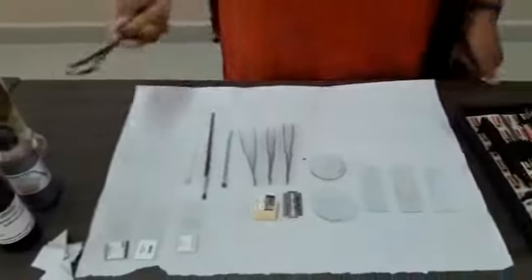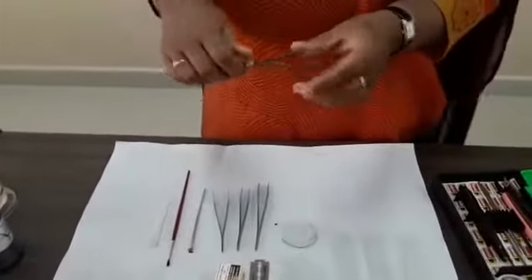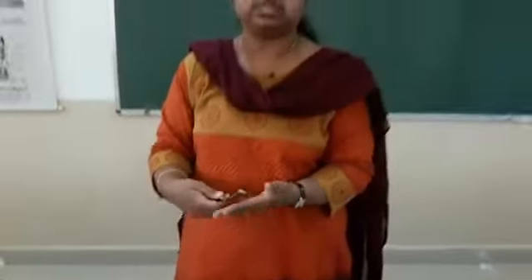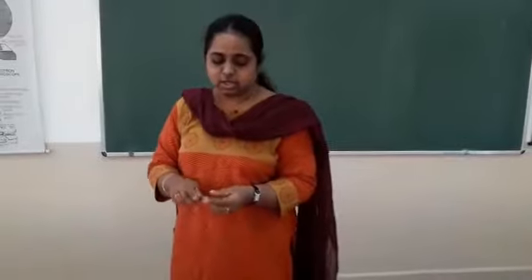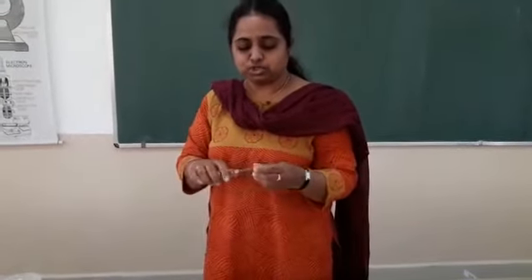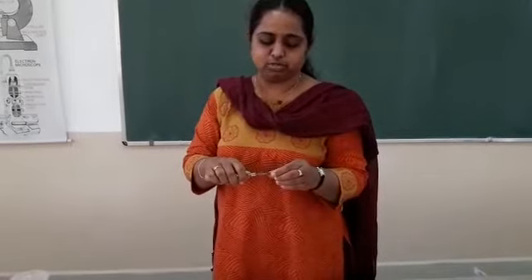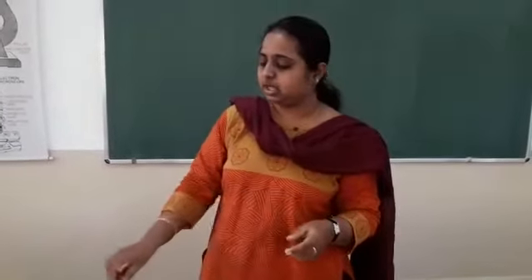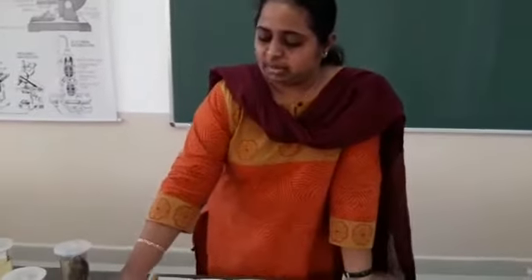Now, this is the holder. When you do physiology tests — like tests to detect the presence of carbohydrates, proteins, or fats — you need to make use of this holder. This holder is also useful in the chemistry lab; you will be using it in both chemistry and biology labs.